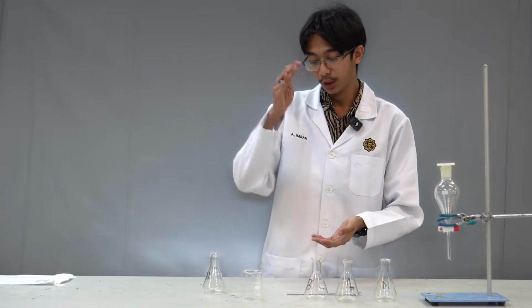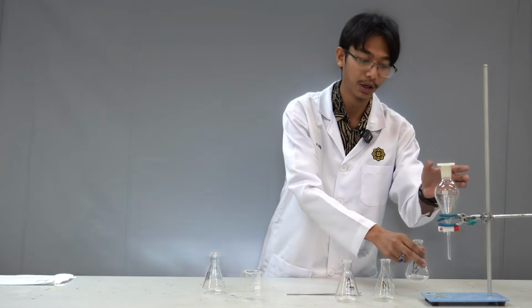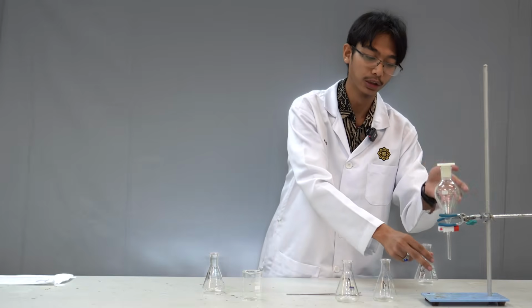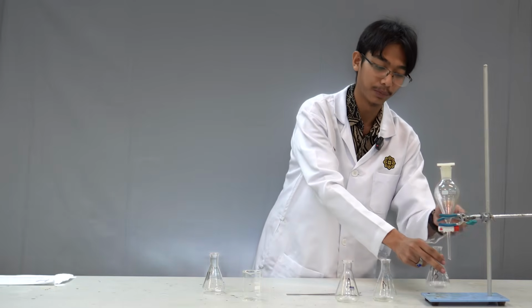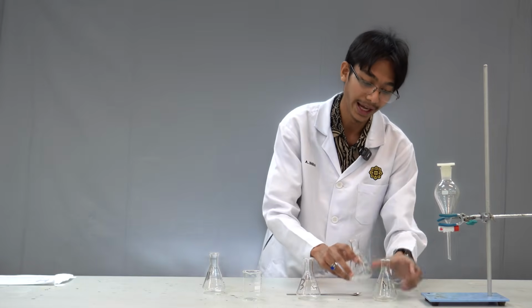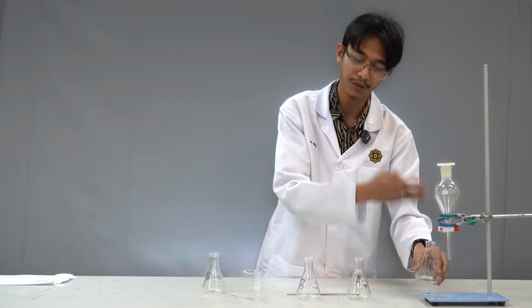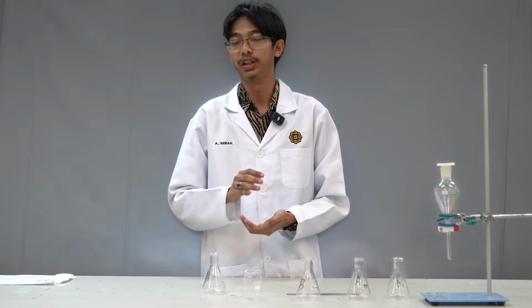So basically, we're going to need these 3 flasks. Per every time we do this experiment, we're going to extract first acid, then base, and then finally what's left is going to be neutral. So how do we get our liquid mixture in the first place?